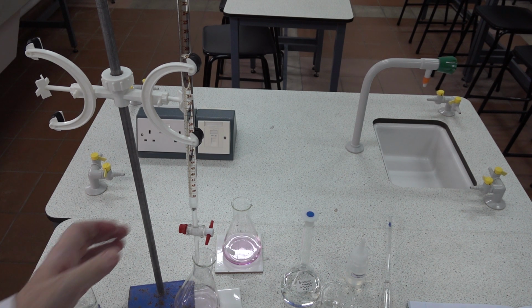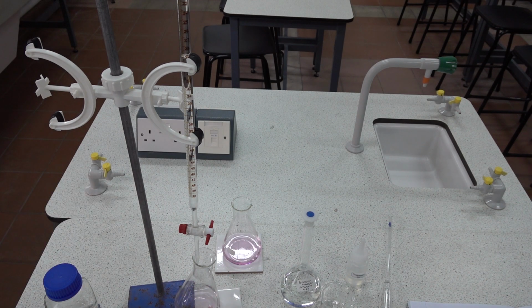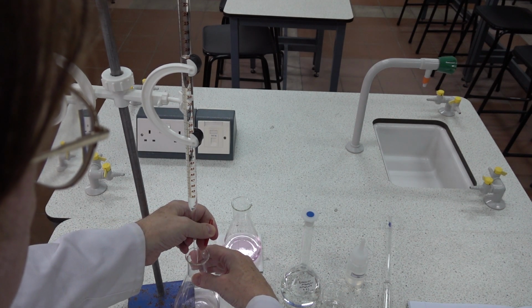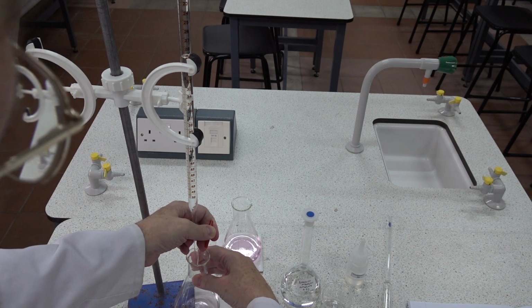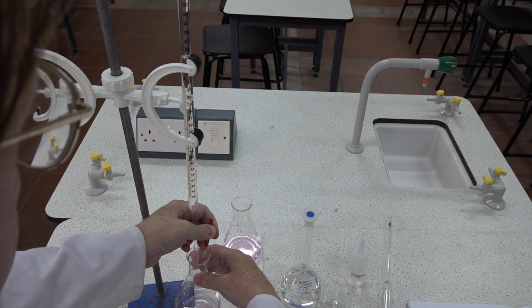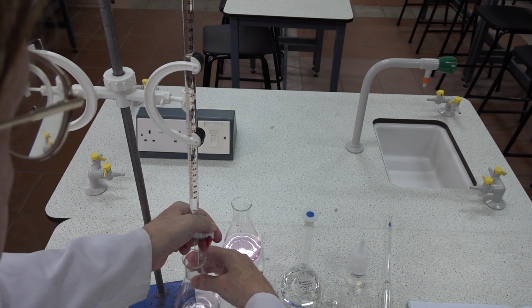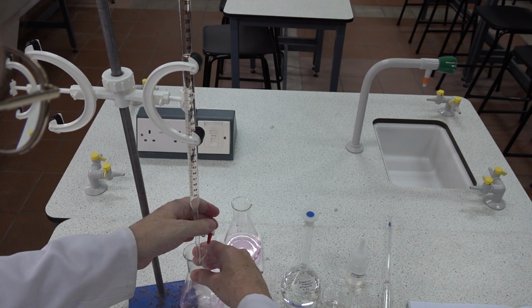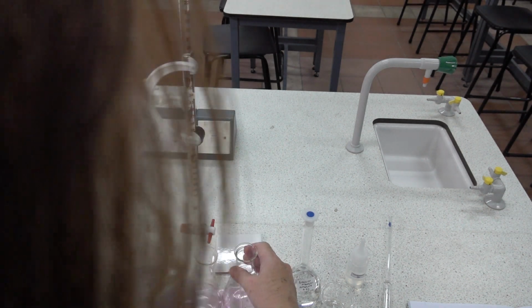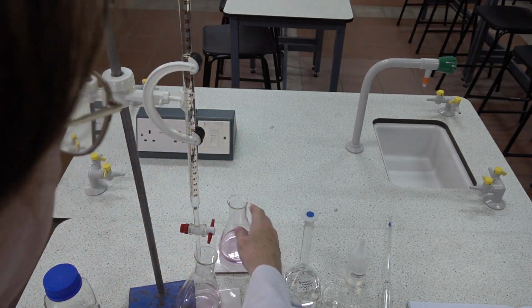29.2 that we're reading. And just to be sure, we'll add one more drop from the burette, and we expect to see a deepening of the pink colour. So we're now at the moment 29.2. One more drop there, and we've got a colour close to the original rangefinder.